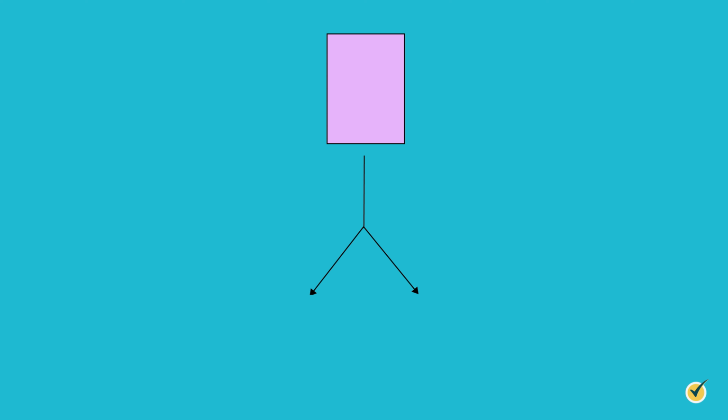Hi, and welcome to this video on chromatography. Today we'll cover the general process of chromatography, discuss the different chemical and physical properties used in separations, and look specifically at the instrumentation used for gas and liquid chromatography. Hopefully by the end of the video, you'll not only understand the theory of chromatography, but also when to use it and why it is a critical tool for chemists.